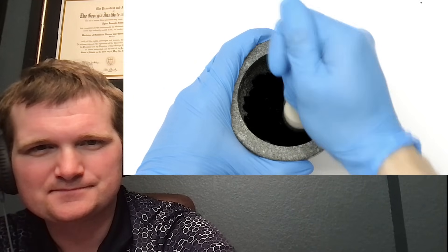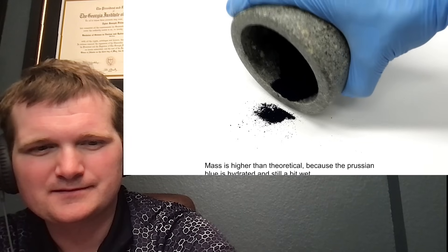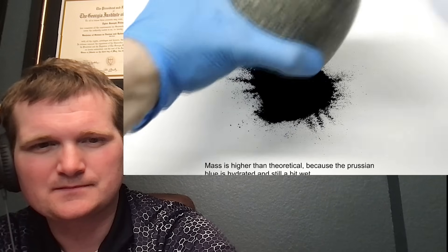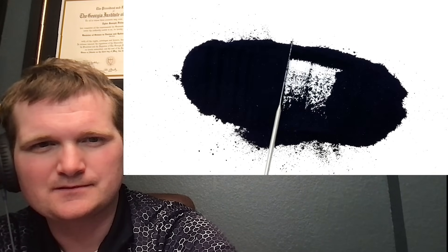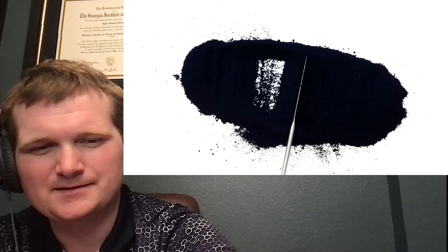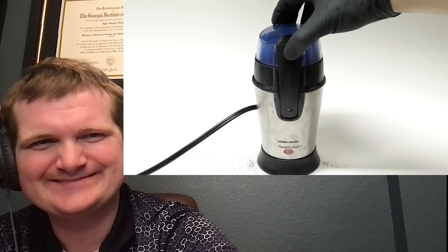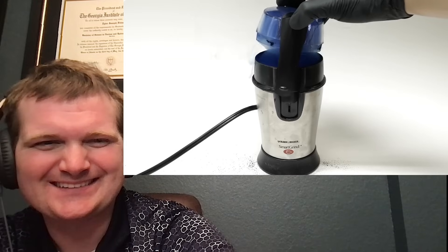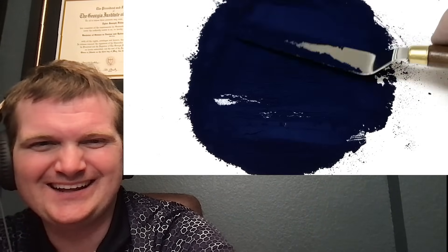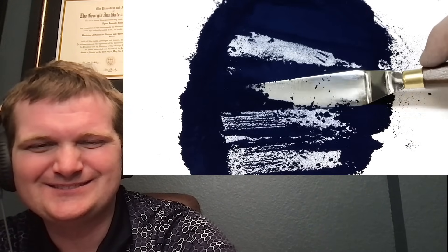I put it all into my mortar and crushed it up as best I could. My final yield of the Prussian blue was 17.7 grams. I really wanted to make some paint with it, but the grain size was still a bit too big — it needed to be a really fine powder, so I put it in my coffee grinder. I ground it intermittently for several minutes, and when I took off the lid there was some really nice blue dust. I dumped it all out, and honestly it still wasn't as fine as I would have liked, but it was more than good enough.